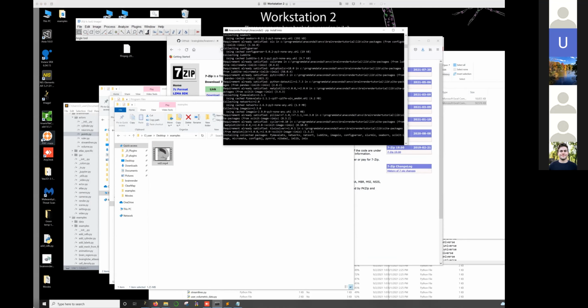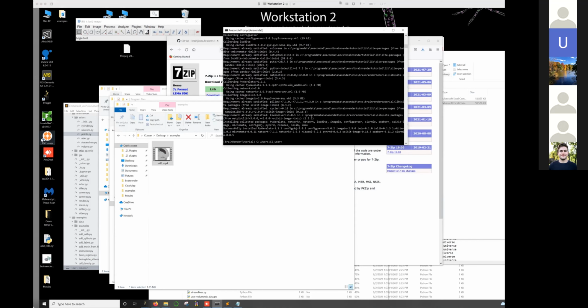And what I'll also do is I'll share this, because I think some of the examples are quite good, but if you're working with the ClearMap and BrainJ data, then this is where you'll really hit a wall getting things to work, especially if you're new to using things like Python and scripts. So I'll share these working examples of how to actually load in volumes and data so that you can get off the ground very quickly.